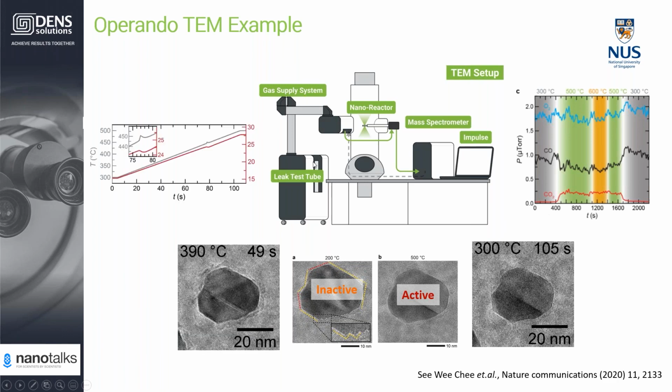Meanwhile, we also have the temperature and heating power response from the calorimetry inside the nanoreactor. Actually, if you analyze the structure and also the mass spectroscopy data, you can see the transition happens around 450 degrees Celsius. And this has also been revealed in the calorimetry data by a spike in the temperature value and also a decrease in the heating power.